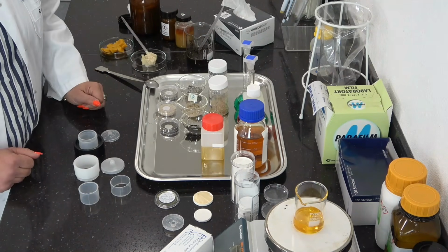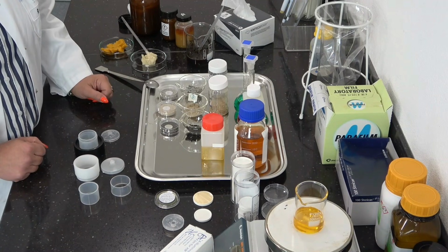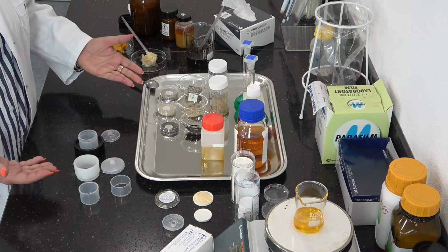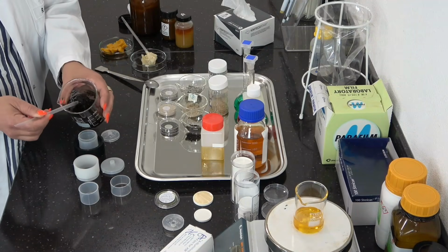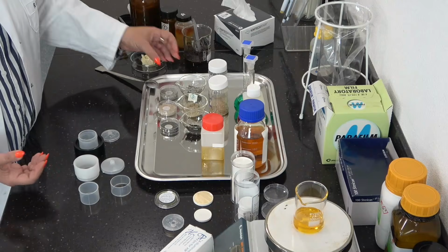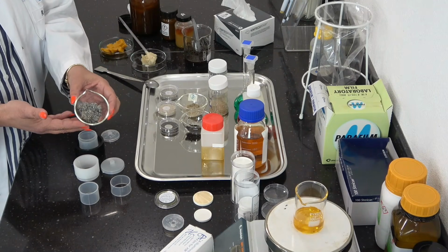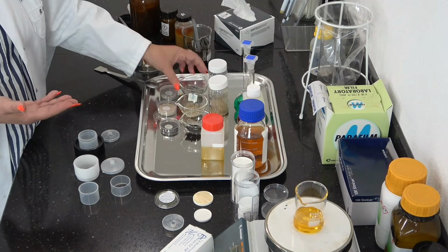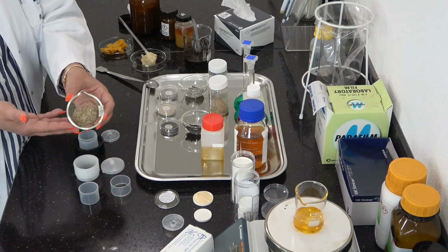If the sample is inhomogeneous, if you have particles inside, of course, this will also affect the results of your analysis. There are a few ways to improve this. The easiest way is to take maybe this kind of sample and dry it. So you will get powder, which is of course also inhomogeneous. I prepared a few powders here. Here we do have some secondary fuel materials like waste material, plastic waste. You can also have maybe some wooden particles inside.